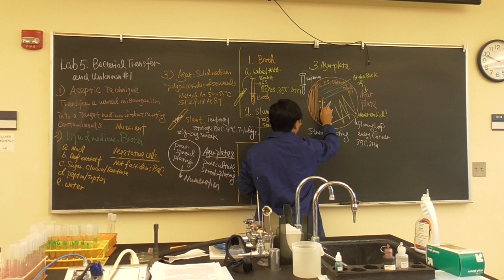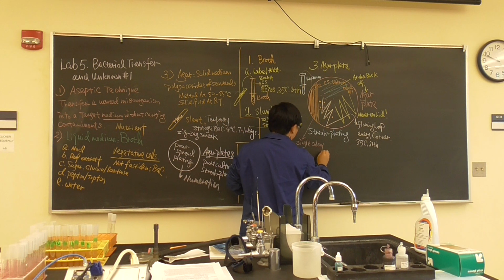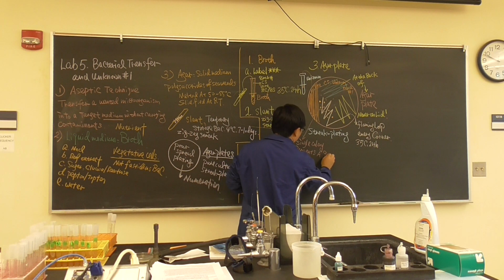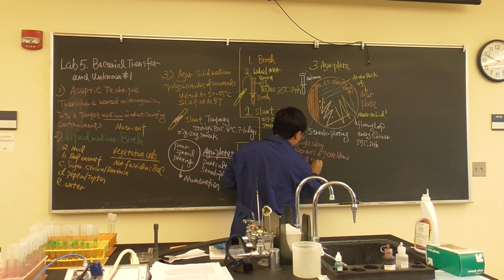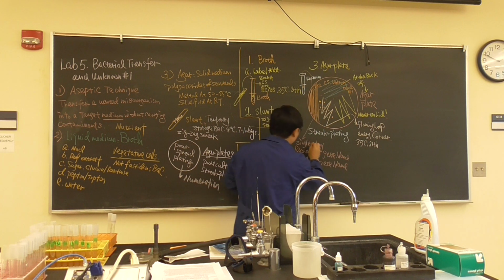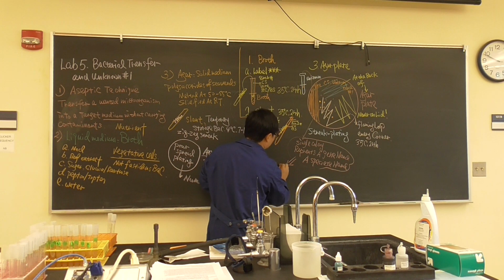This is a single colony. It represents a genus name, a species name, this whole thing represents a pure culture.